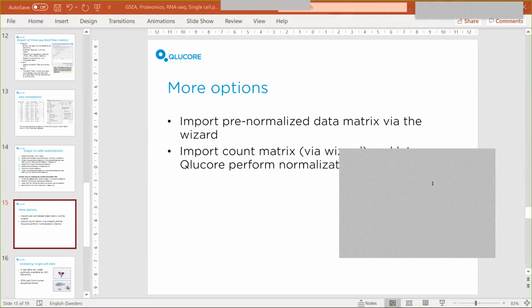I'm not sure if the data that you describe here is any different from other. I can take this question and check with my expert colleague. So I'm just making a note of that. I guess you would then have that as a count matrix. I might need some more information from you. Maybe you can send me an email with more information regarding that question, and I can take it to my experts. Thank you, Laurie, for participating.